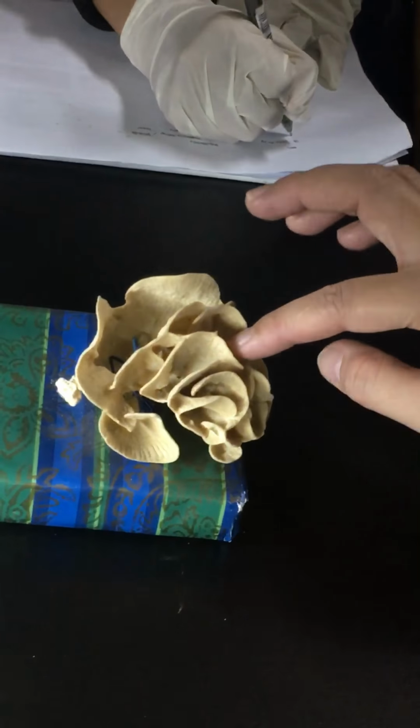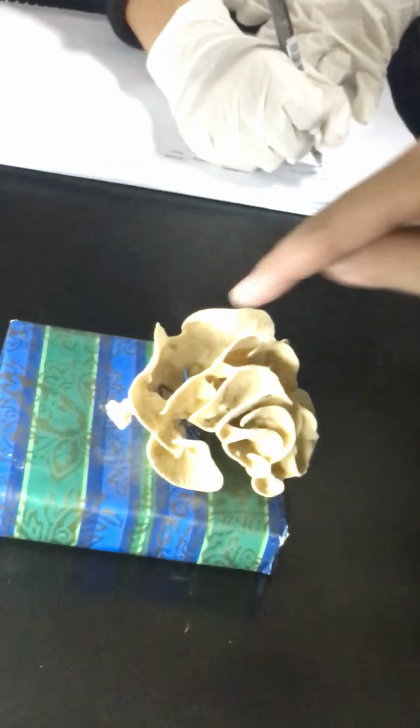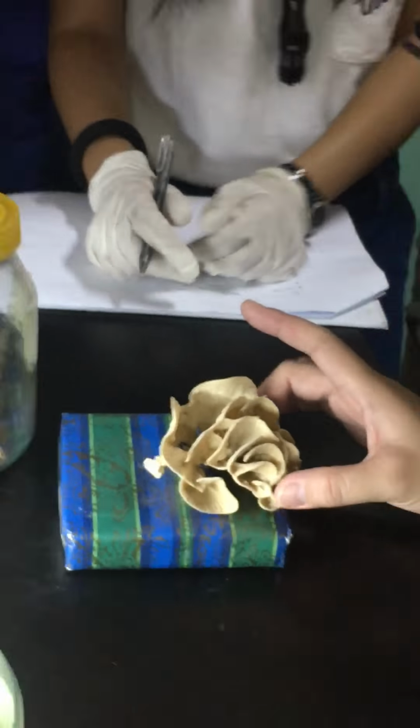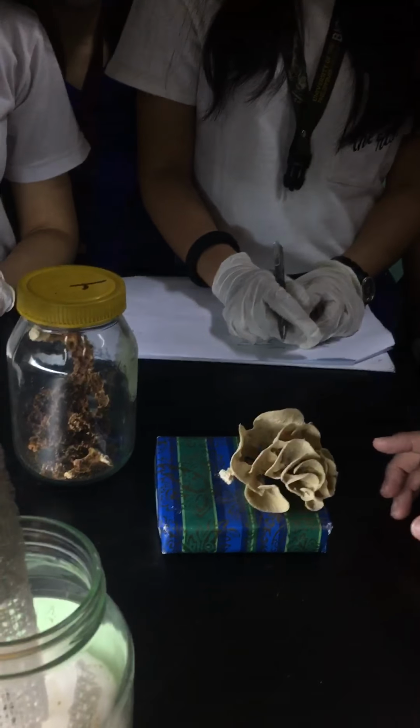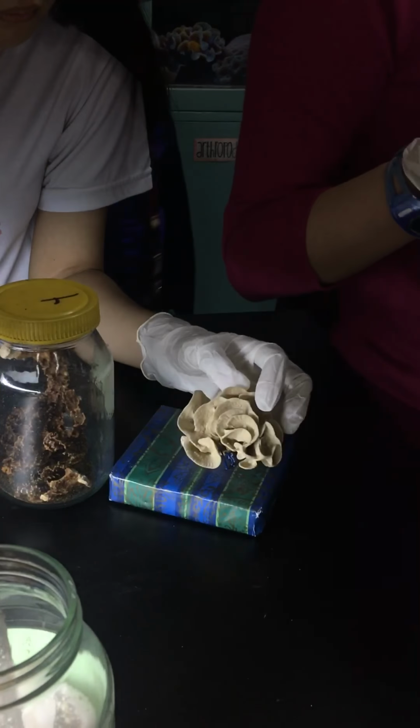Alright. And then the next, this one is Carterospongia. Okay, it is still a demosponge. So notice that it is highly reduced. These are actually the number of their spongocoel. The look of them is reduced. They look flowery, right? So, Carterospongia. And then the next.